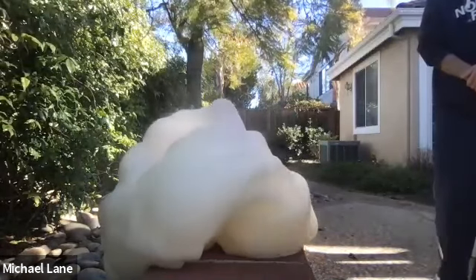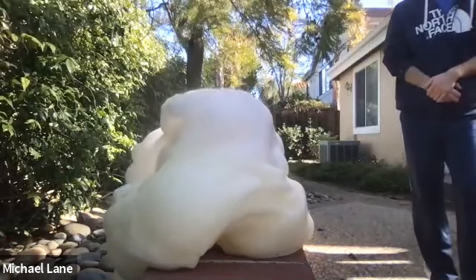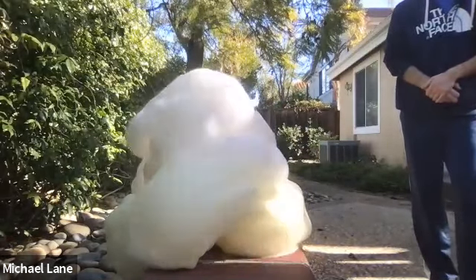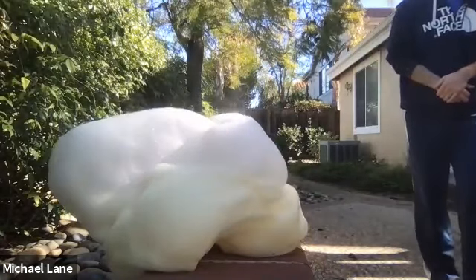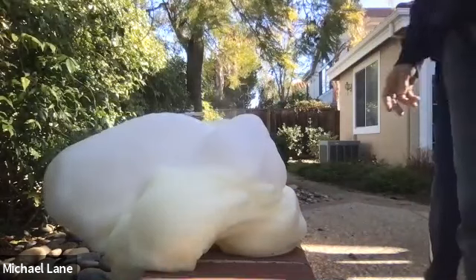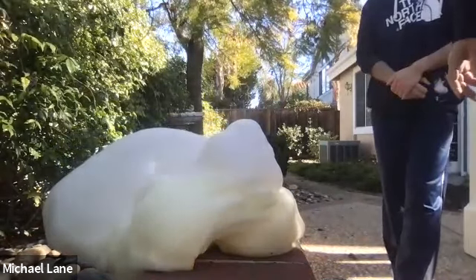And perhaps if you're a fan of the Big Bang Theory, you've seen this there. It has been demonstrated in a number of different places and contexts. Sometimes this is referred to as the elephant toothpaste demonstration. Okay, so I'm going to stop the video here in just a moment, and we will discuss these reactions in class.